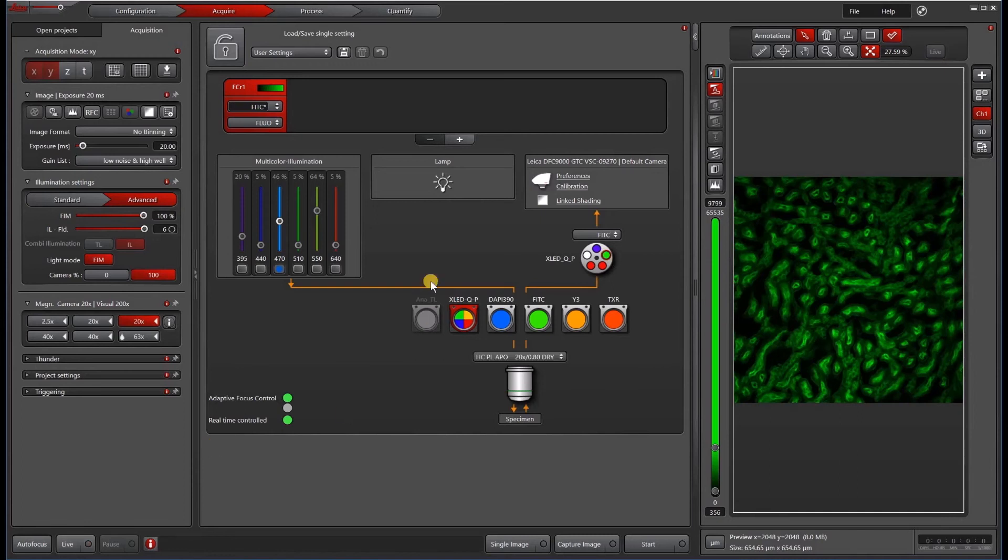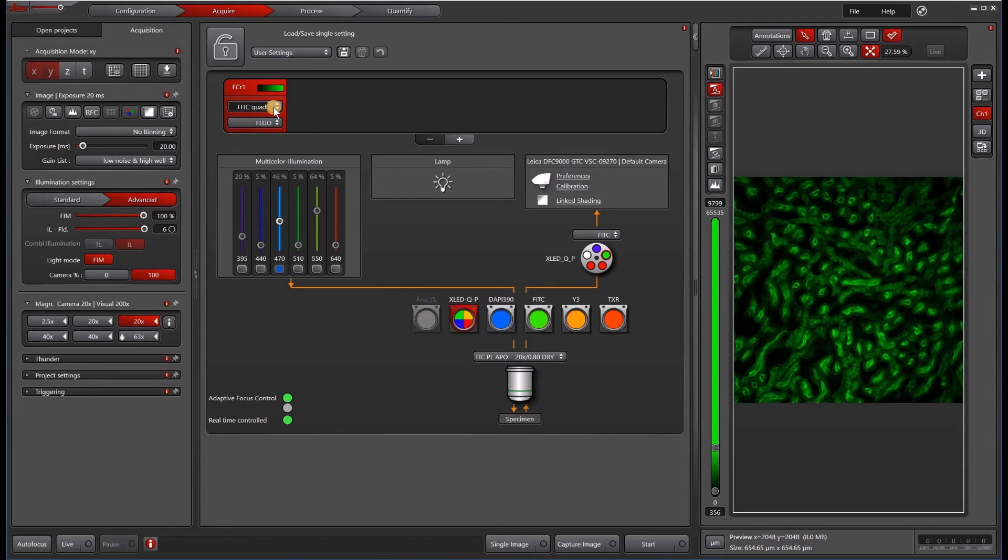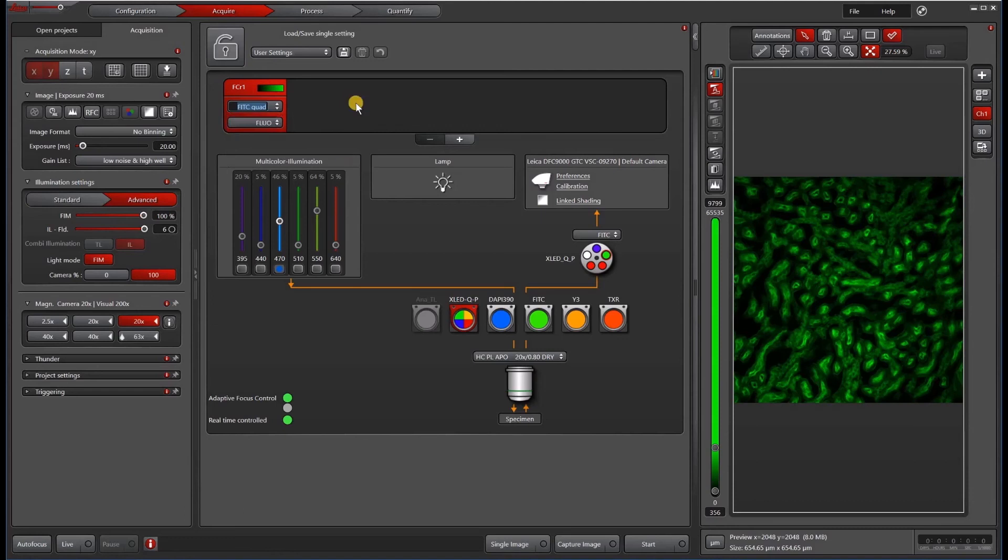So if we're happy with this setup, then I want to right click save. And we'll call this one, instead of FITC, we'll call it FITC quad. Under our menu, we have FITC quad and we have just the regular FITC single cube.